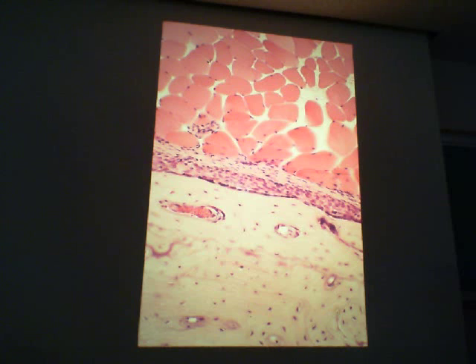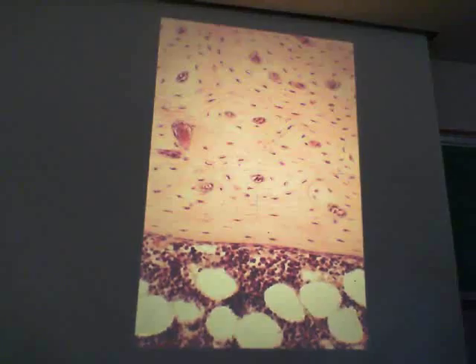So this is all periosteum, and just inside the periosteum we have what? Outer circumferential lamellar. I will guarantee you that somebody's going to mix those two up on a lab practical. Okay, and what is this thing right there? Osteon. And right in the middle is what? And these are what kind of cells? Osteocytes. And a thin layer right there is what? Endosteum. Okay, and then we have red bone marrow down there.